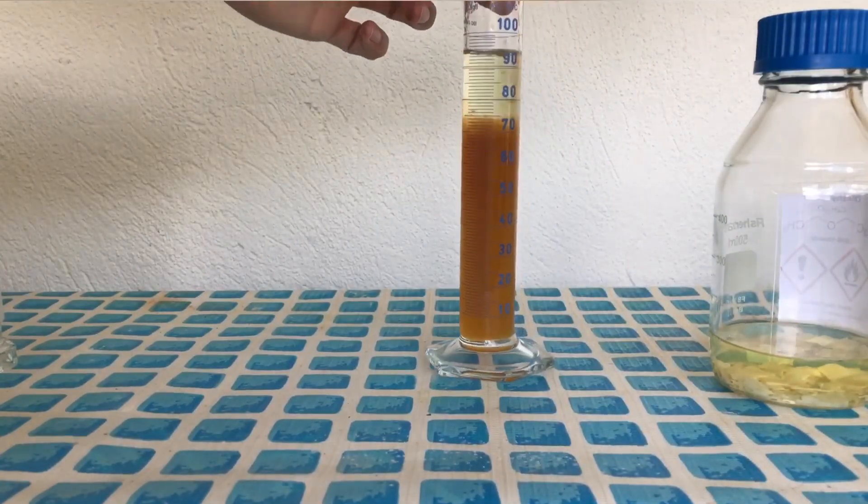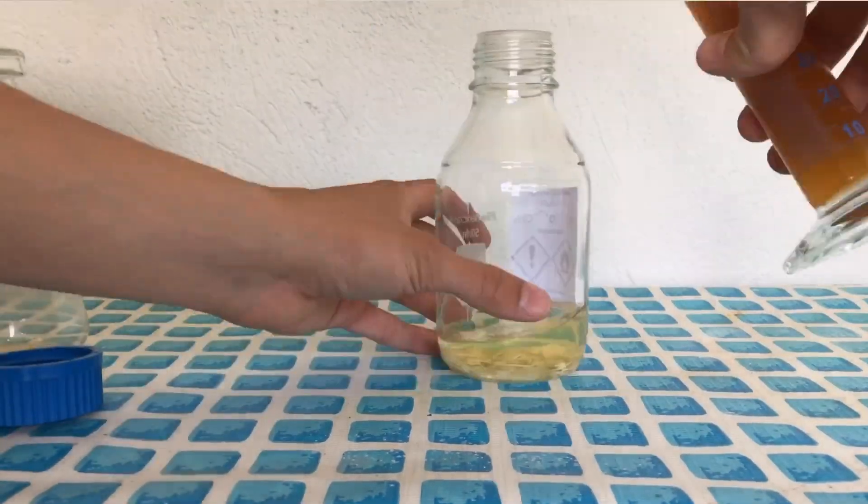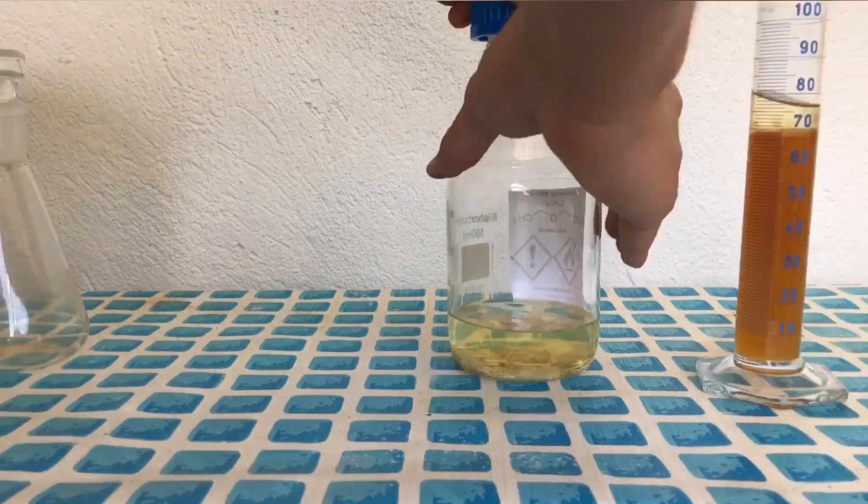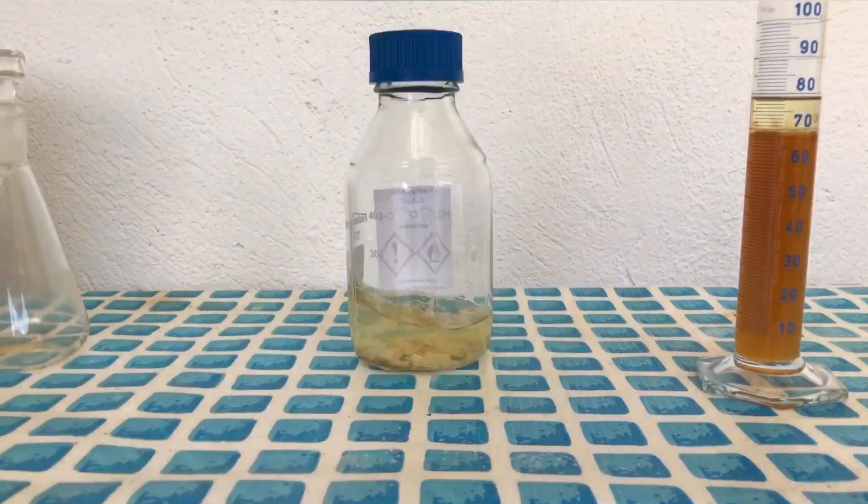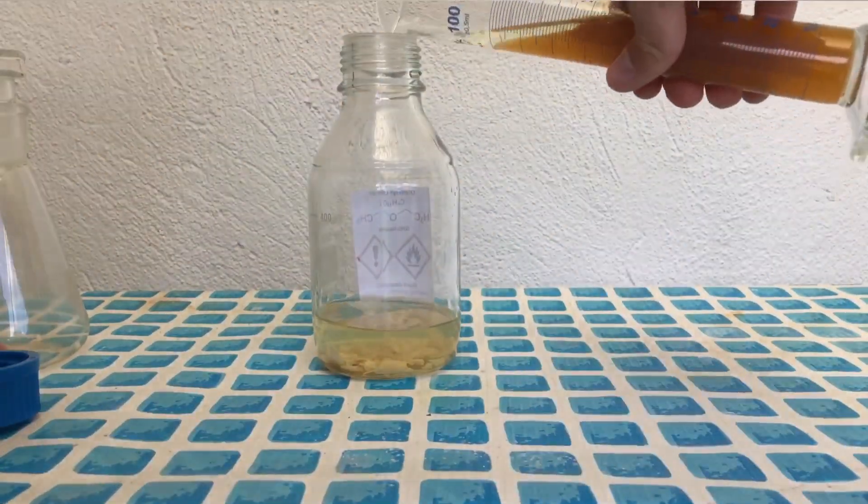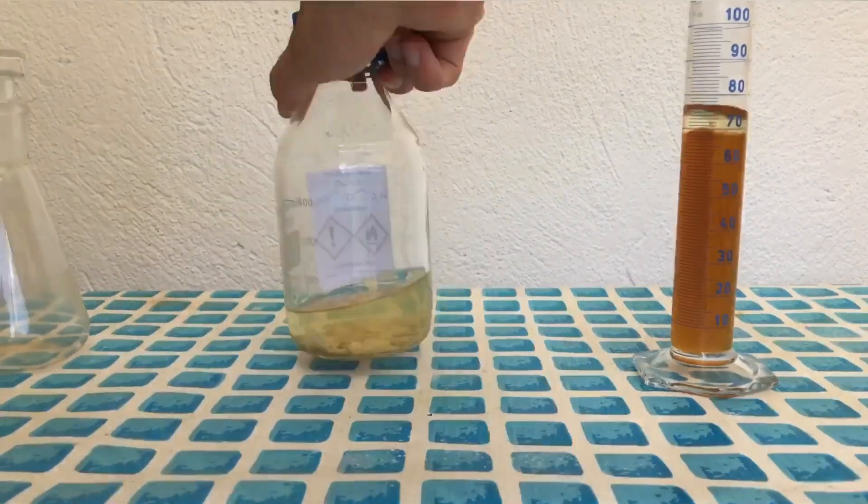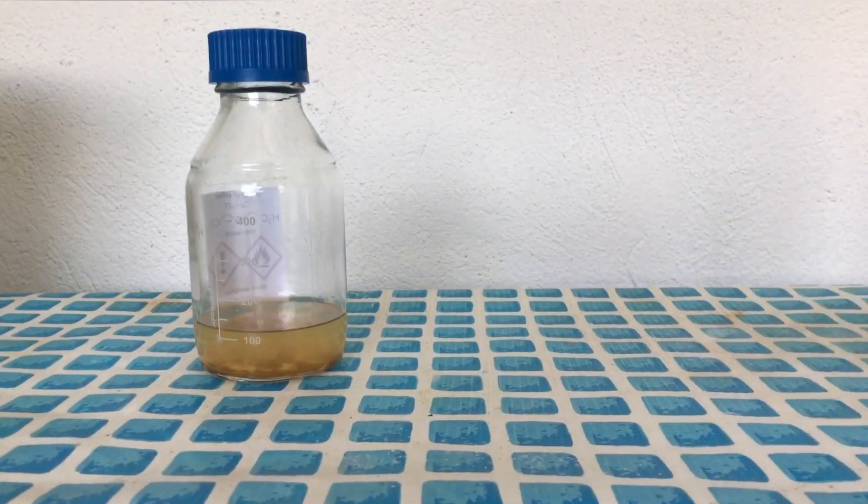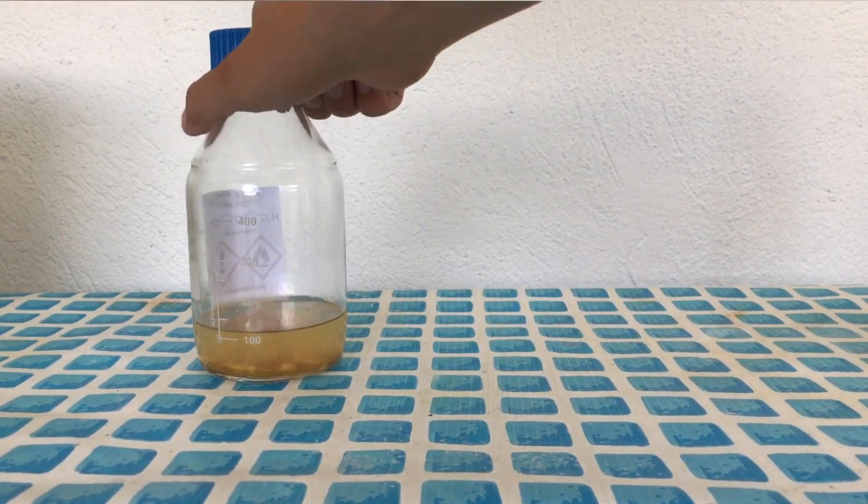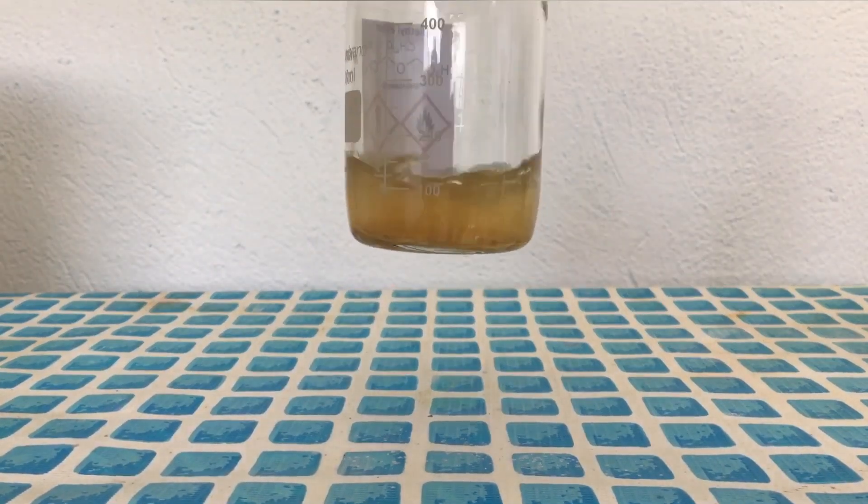The ether still looks a little bit dirty, but I'm not going to purify it any further and I'm not going to test it for peroxides. We should have removed most of the peroxides, but why am I still not testing it? Well, I will neither use it for any reactions, nor for any extractions, and therefore it won't be distilled and peroxides won't be any problem.